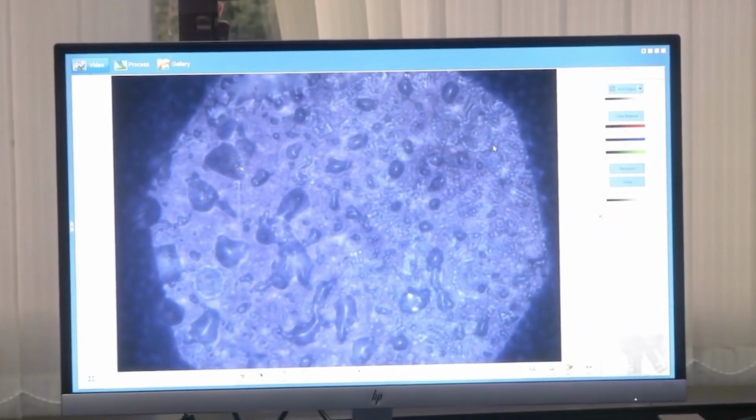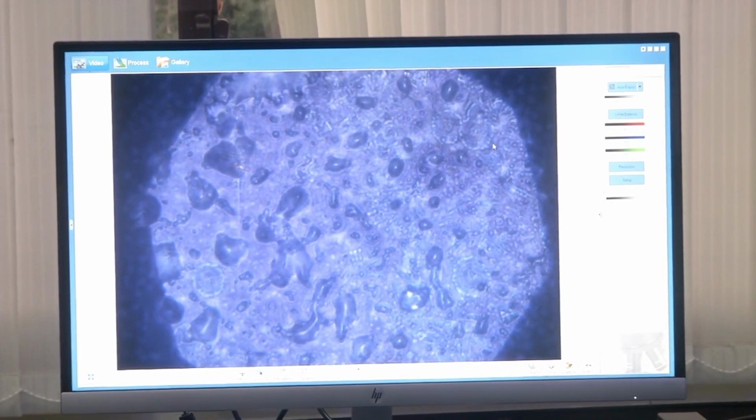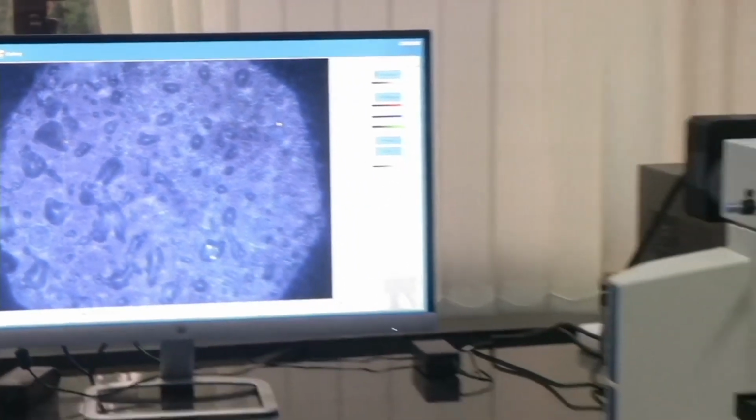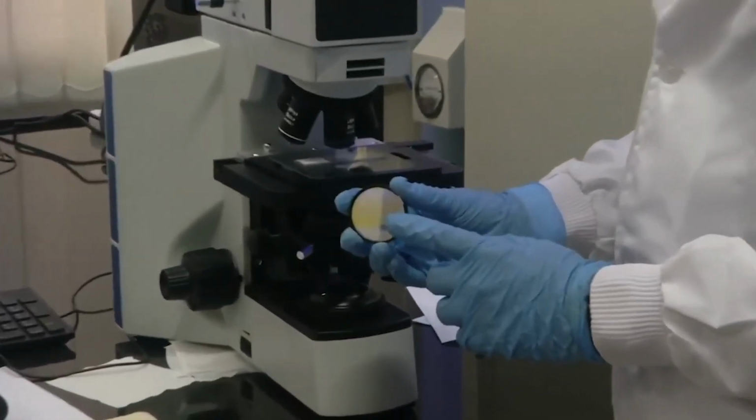Now let us see one more thing. So, now you have understood how top illumination works, how bottom illumination works, how we have to focus it, how images will be there, how image will be captured, as I have shown. Now, two more things let us introduce. Just like the filter for the top illumination, we have filters for the bottom illumination.